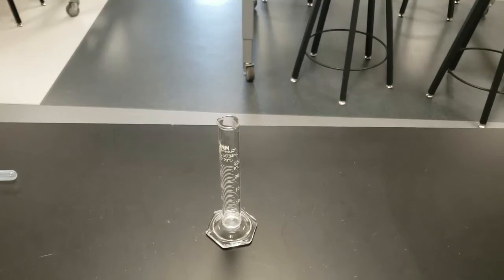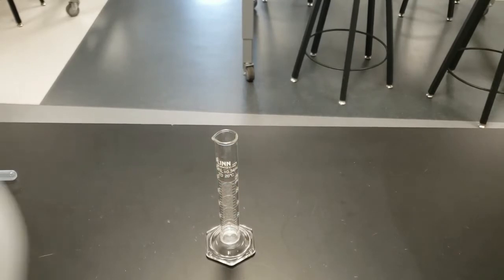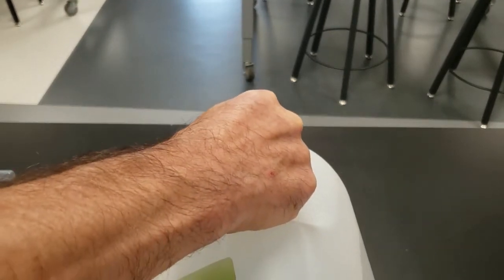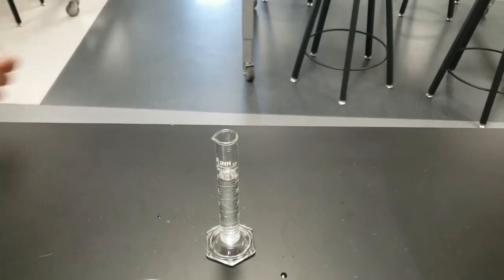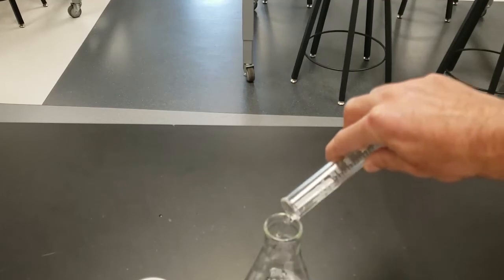All right, so the first step says to carefully and thoroughly clean an Erlenmeyer flask and place 30 milliliters of distilled water in it. So I'm going to take my graduated cylinder and pour some water in there, get it pretty close to the top, fill this thing up to the 25 milliliter mark, and then I'm gonna take that and pour it in there.